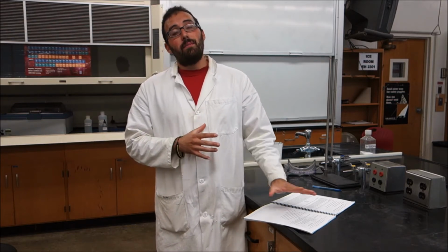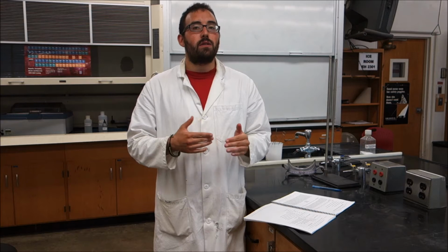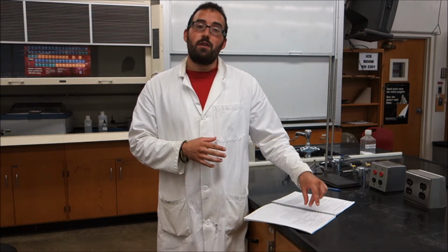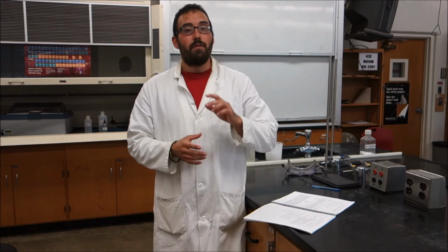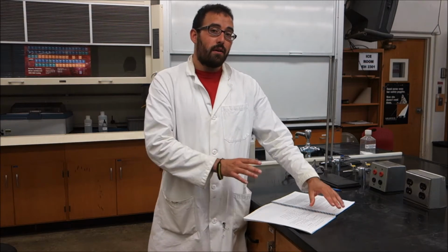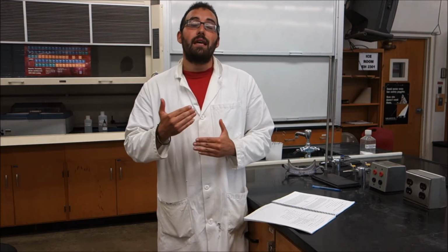Now, those compounds in there, you are going to first check their pH to figure out which ones are acidic and which ones are basic. And then you're going to use the acidity and basicity to determine which set you have. After that, you're going to use the solubility rules to figure out which solution is which. Now, if you look at it, the chart is split up into 2 sections, those that are typically soluble, those that are typically insoluble.